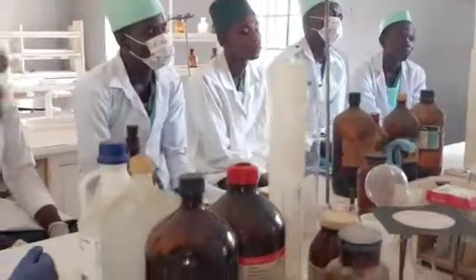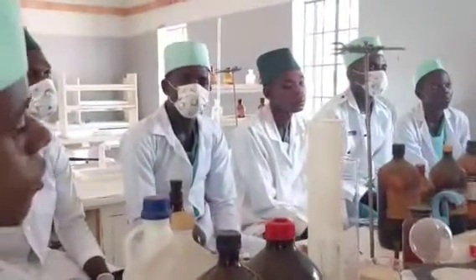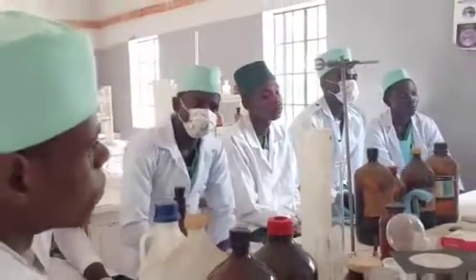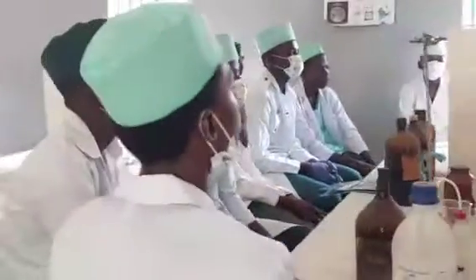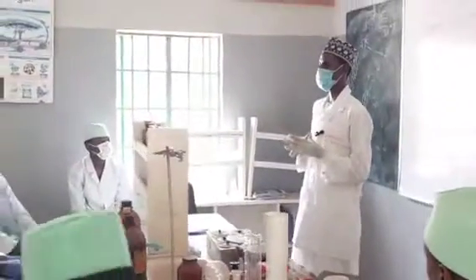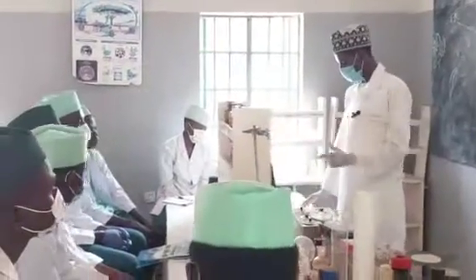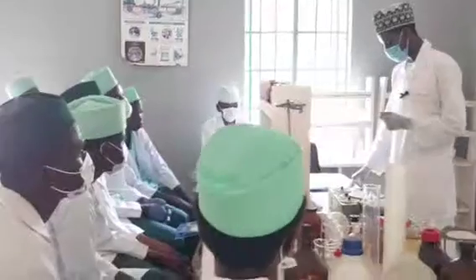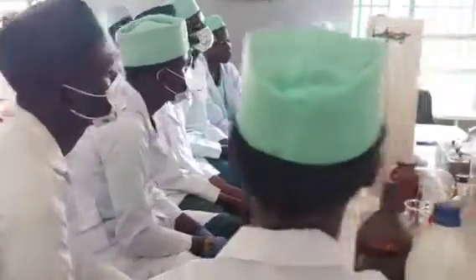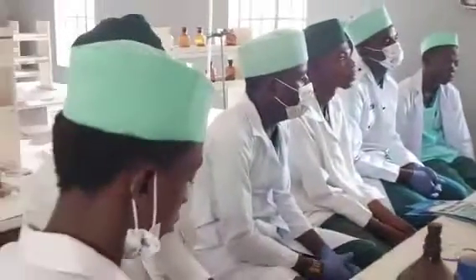For instance, you want to just do some titration, then you prepare so much of the chemical. I have told you earlier, these chemicals are very costly. So you should minimize the usage of the chemical, to avoid chemical wastage. So as a good practicing chemist, you should make sure that you avoid wastage of chemicals. Do not throw hot concentrated acid into the sink.